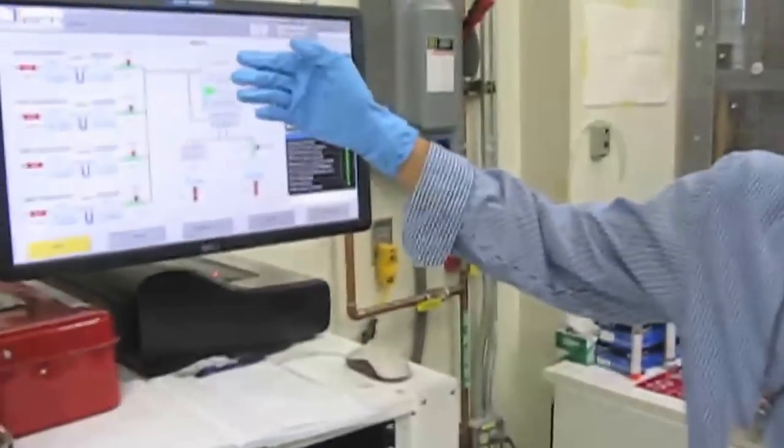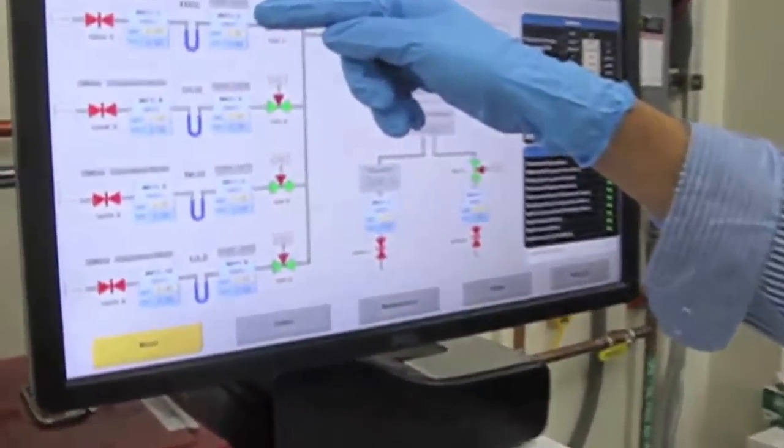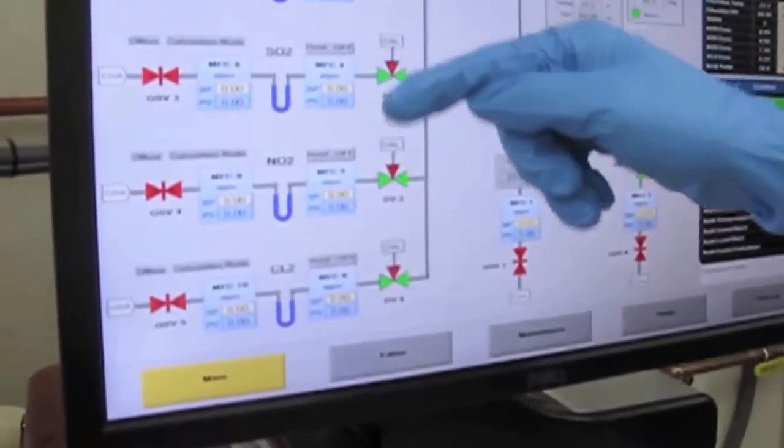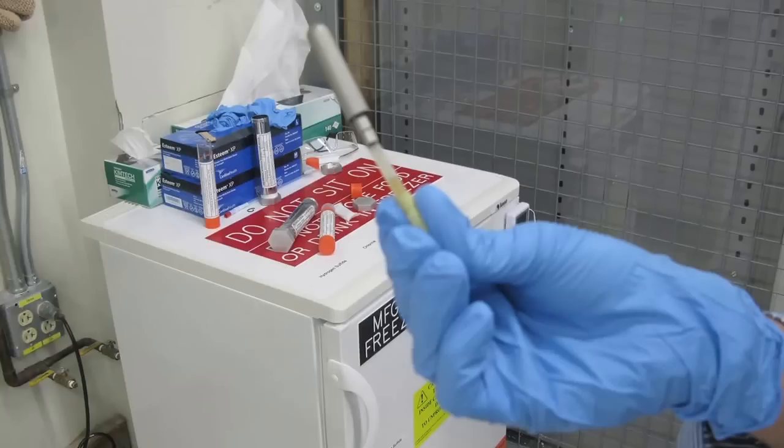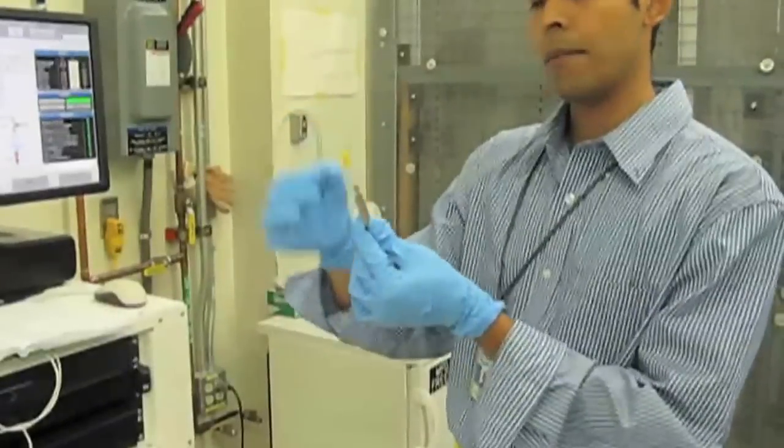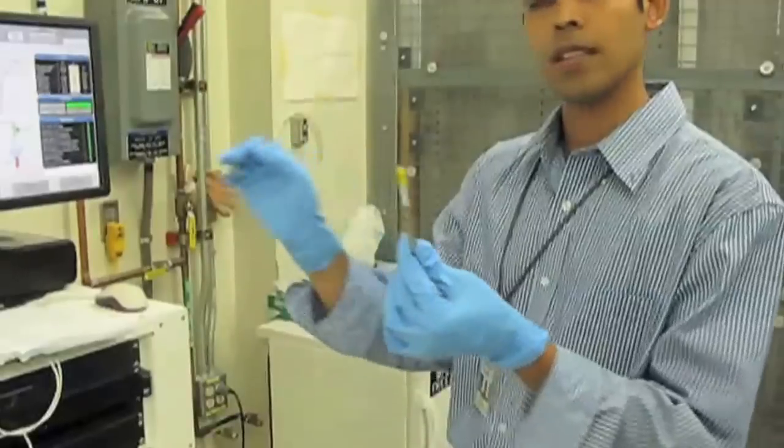You can see from the interface we are introducing four different gases like H2S, SO2, NO2, and Chlorine. We are sourcing the gas through something called a permeation device. This device has a membrane, a polymer membrane which uses the gas under temperature.